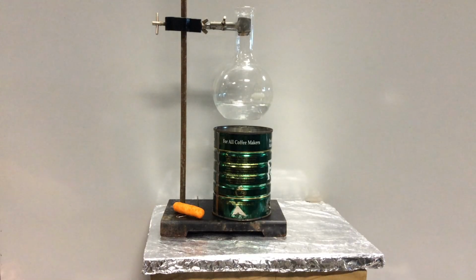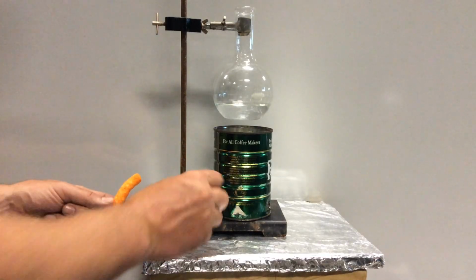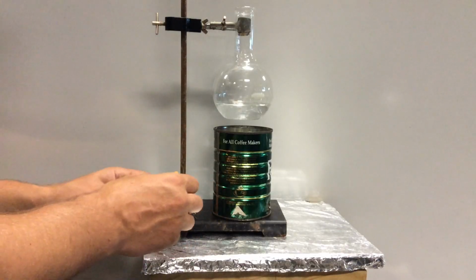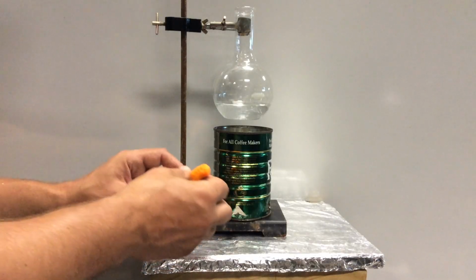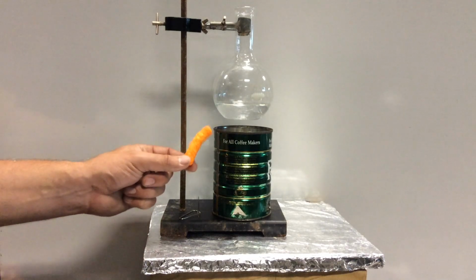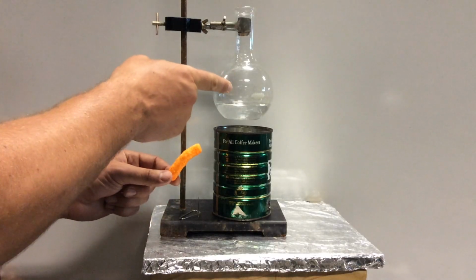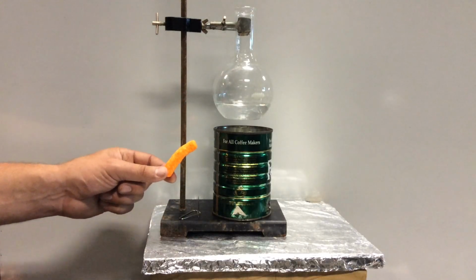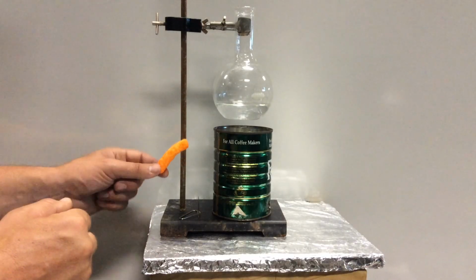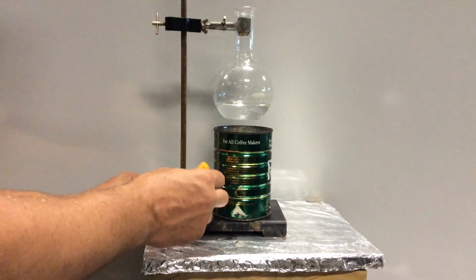But before we do so, the object that we're going to test here is this Cheeto. What I've done is taken a paper clip and bent it in such a way that I've made a stand for it. What we're going to do is mass out this Cheeto, because we want to know the mass of the Cheeto, because once we find how many calories of energy the water has absorbed, we'll be in a good place to get calories per gram. So we're going to measure that out, then I'm going to impale it on this stand.